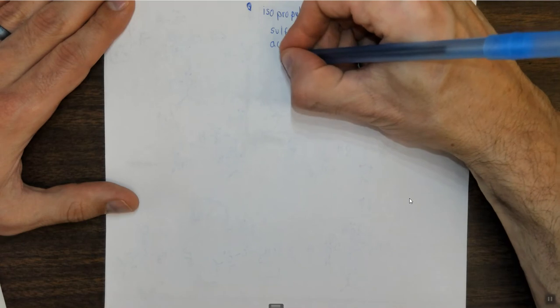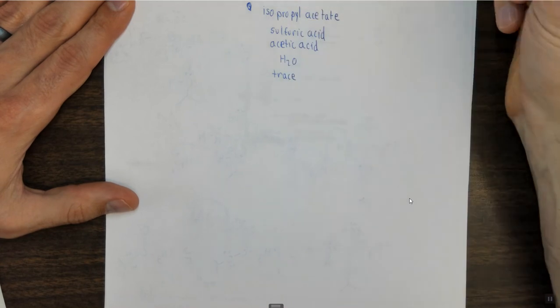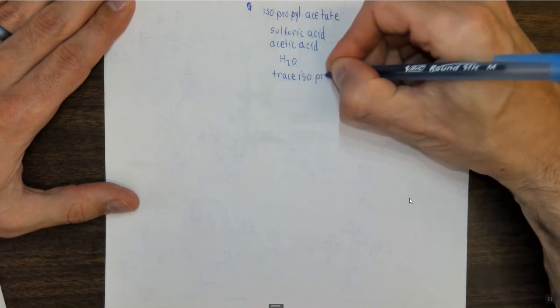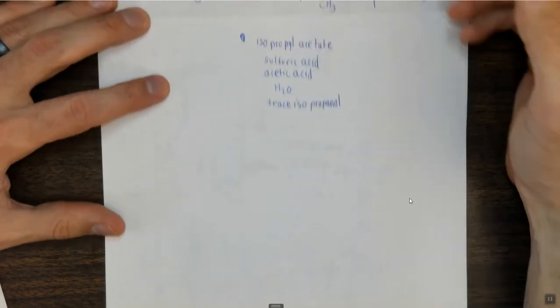We're going to have water, and we're going to have trace amounts of the isopropanol, because it may or may not all get used up. It's a reversible reaction, so it probably isn't all going to get used up.